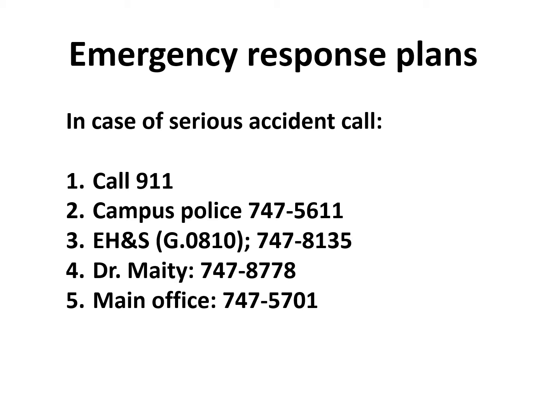If it's not a life-threatening emergency or anything big, just like a chemical spill or something like that, you call environmental health and safety. They're on the ground floor of the CCSB. And then no matter what happens, we also have to call Dr. Mighty. He's the instructor of record for these classes. And if you can't reach him, you call the chemistry main office and they'll route through. But like I said, for this semester, you don't have to worry about any of this. This is just for your information, and it might be on your quizzes and exams for this semester.